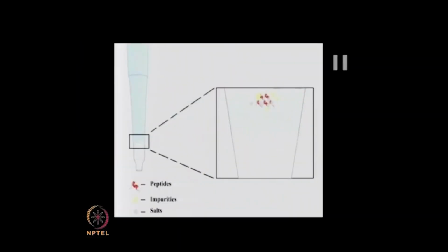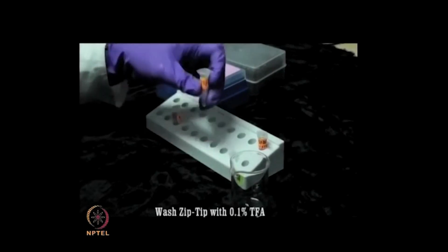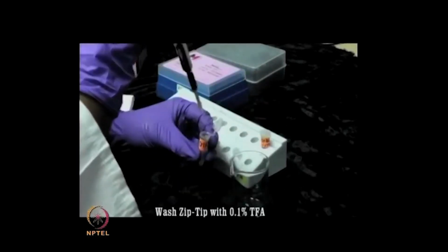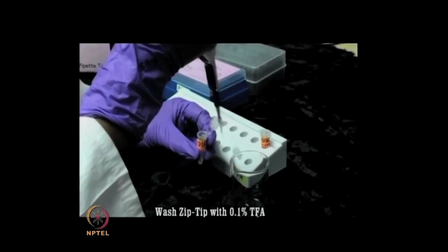So, first you need to attach the zip tip pipette tip on top of a suitable micropipette. Condition the zip tip with 10 microliter of acetonitrile. Perform the wash step 3 times and wash it with 0.1% trifluoroacetic acid or TFA.